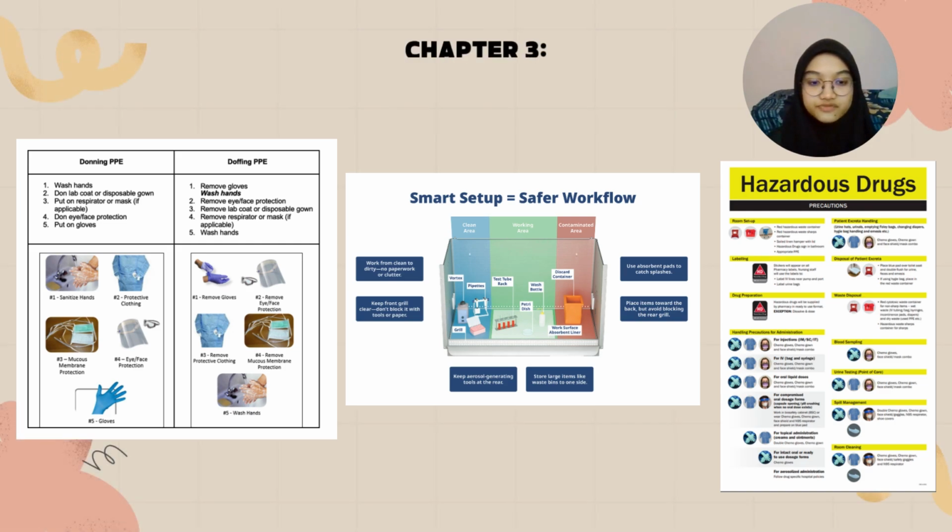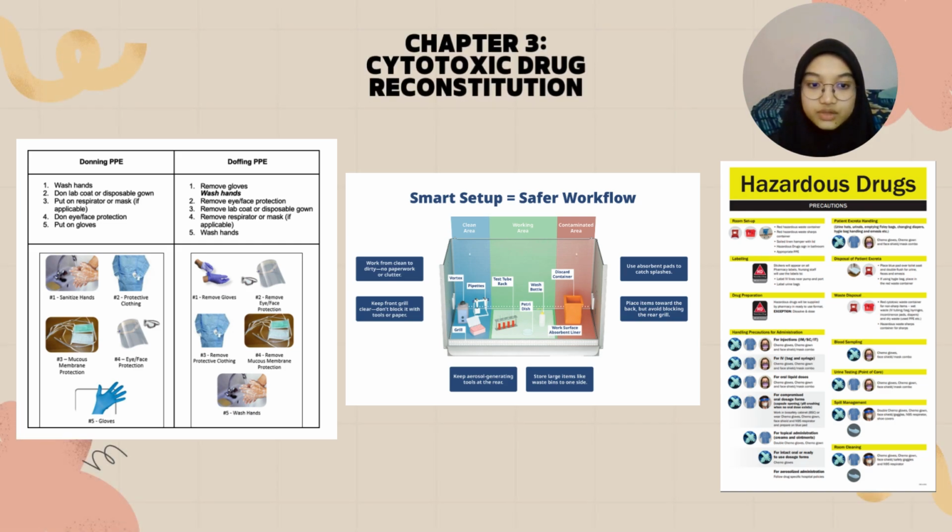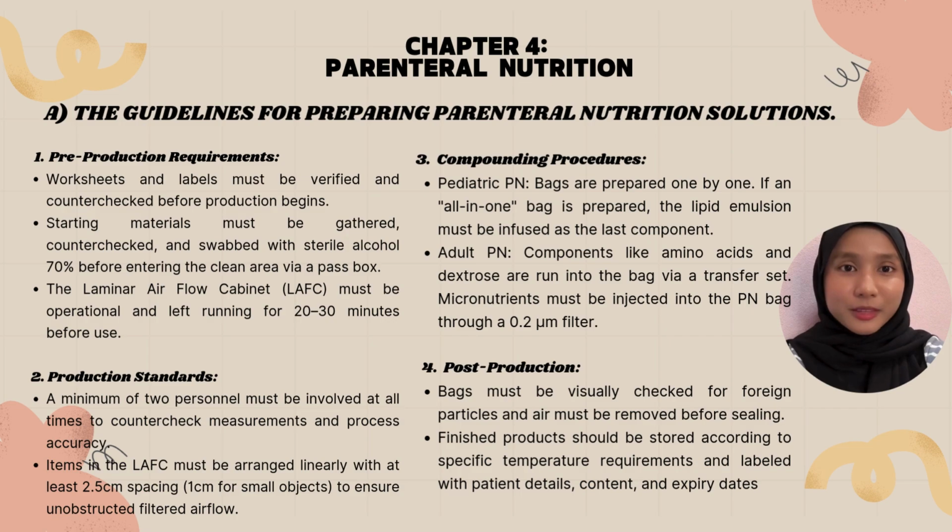Here we have pictures for appropriate PPE and also smart setup for a safer environment and also precautions for hazardous drugs. Preparing parenteral nutrition is a high-stakes process where precision is non-negotiable. It begins with rigorous verification.